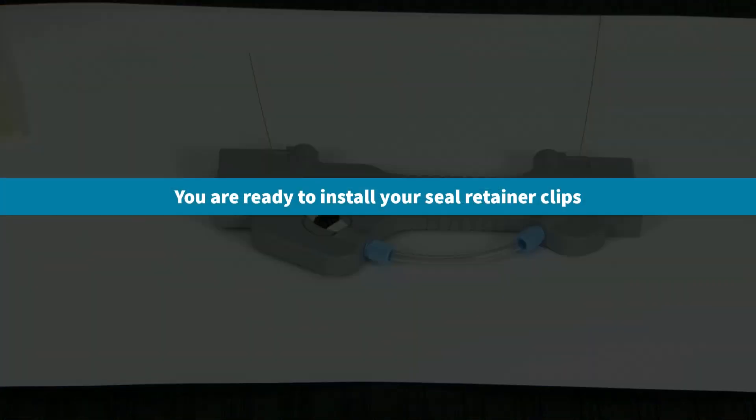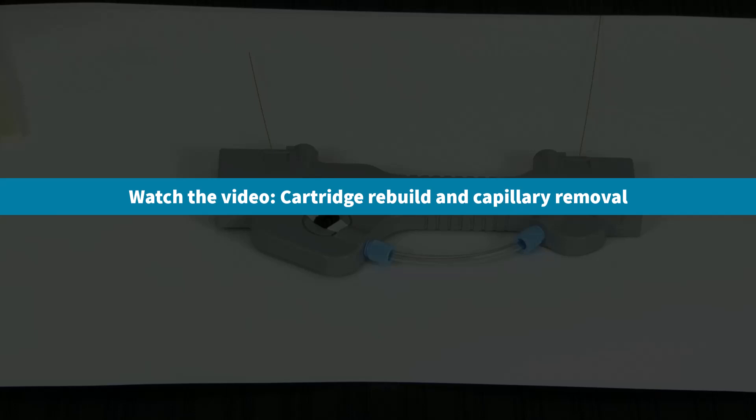Now you're ready to install your seal retainer clips. This is covered in our video titled Cartridge Rebuild and Capillary Removal.